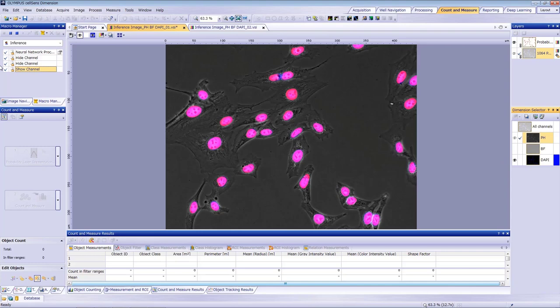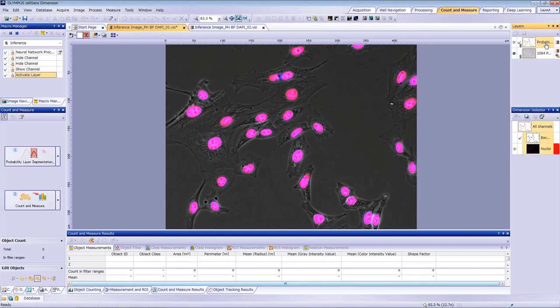The gray value isn't the intensity of the DAPI fluorescence but the probability of an object being a nucleus. While this image includes the DAPI channel, it's only to verify the data. It's not used for the inference process.